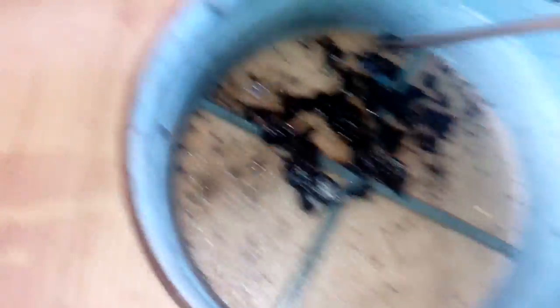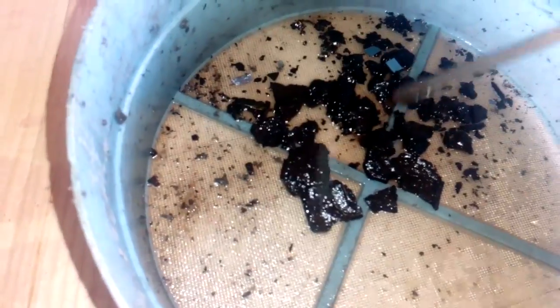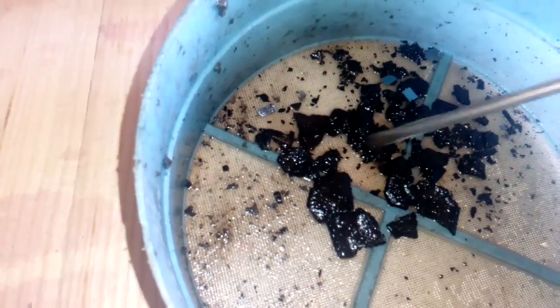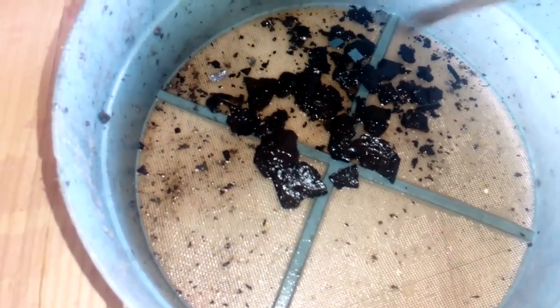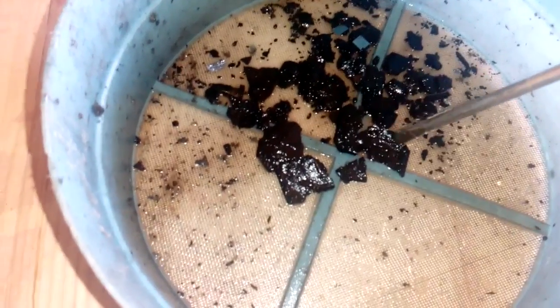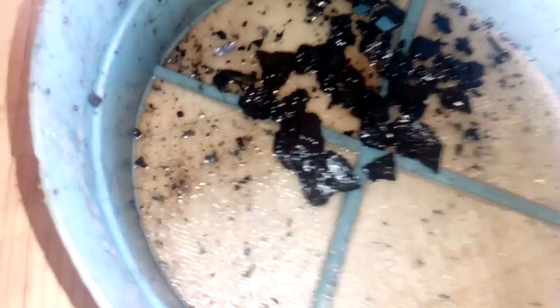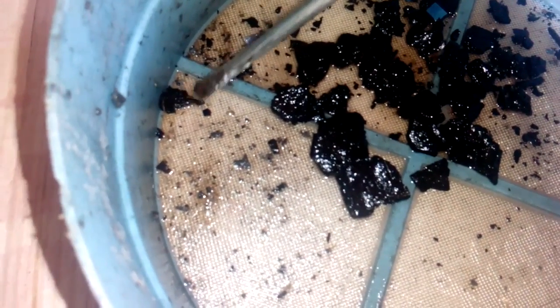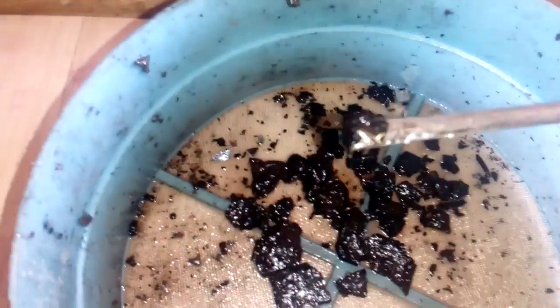Probably if I put some aqua regia in there now, I could dissolve all that bonding wire. So I can say this is a halfway successful experiment. But if you ask me, I will never use this car battery acid for wet ashing, because this stuff just takes too long and it's not powerful enough to dissolve all that.